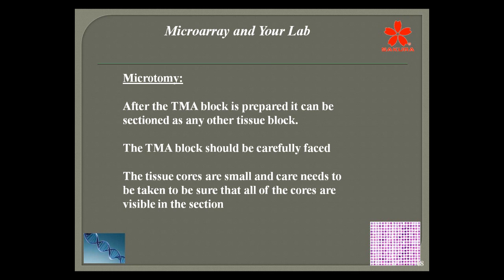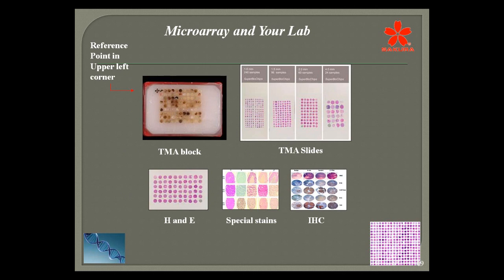If it's tissue that's been overly processed, you may need a little soaking. You may need to face it and then let it soak a little bit. That's the method that you utilize. The thing about it is you're having lots of characteristics of tissue in that one block. You may have hard, fibrous connective tissue against some very soft, porous tissues, some dense tissues, some hard tissues, some soft tissues. So it's an array of different types of tissue that you'll have to section very carefully so that you get a nice section of each and you don't have a lot of microtomy artifacts.